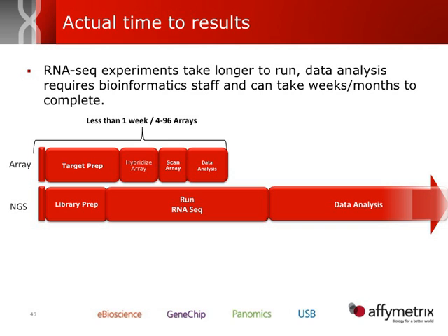So I just wanted to end with this slide here showing the time to results. Remember, one of the factors that we talked about very early on in the presentation today was time to results, getting to your results very quickly. And the time to results with the array analysis is very, very quick. It's less than 1 week.